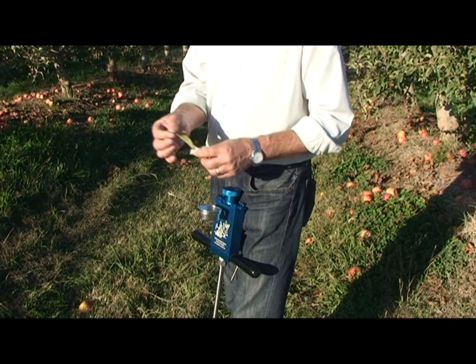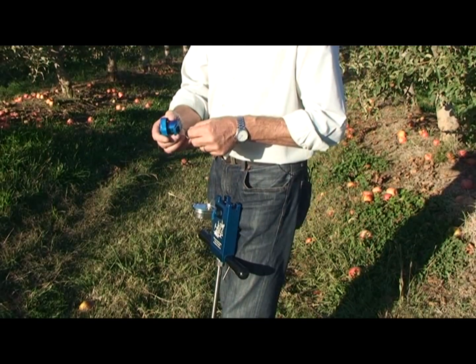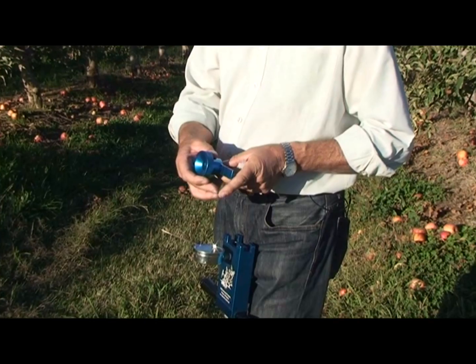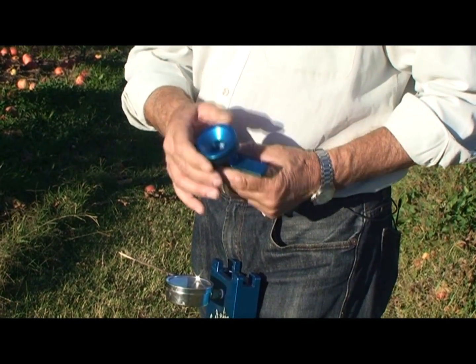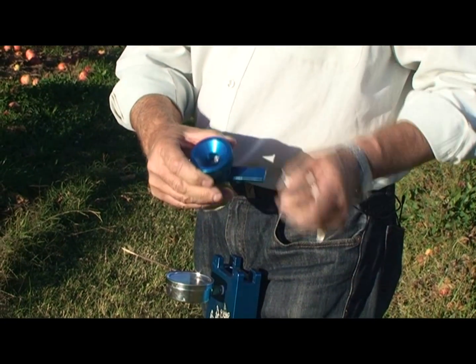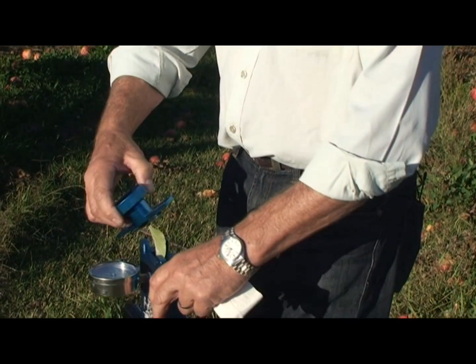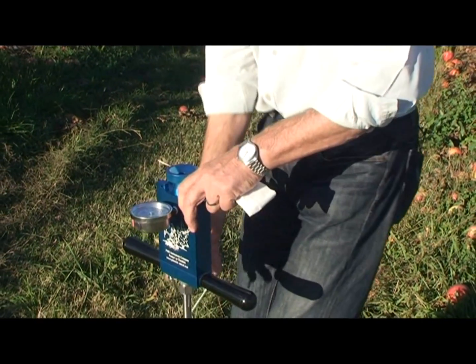We then take the leaf sample and place it in the lid of the pressure chamber, and then seal the lid with the stem of the leaf protruding through the lid. We put the lid back on the chamber and pin it in place.